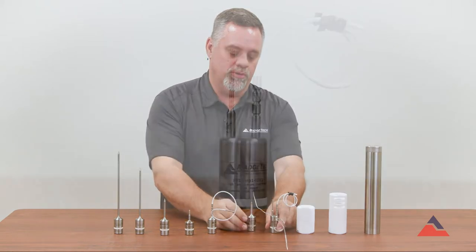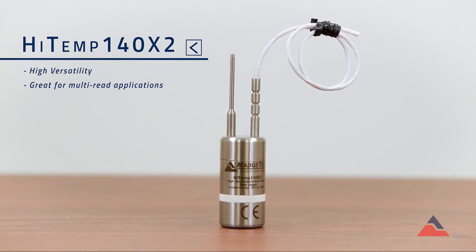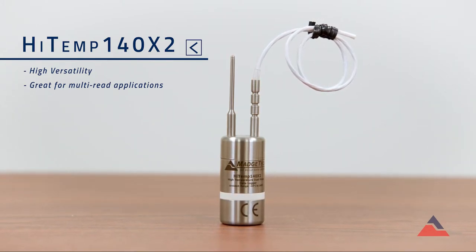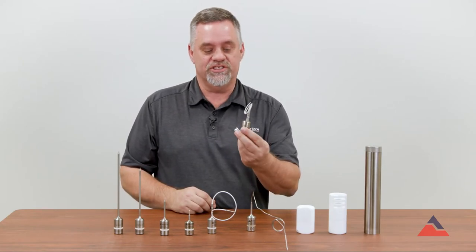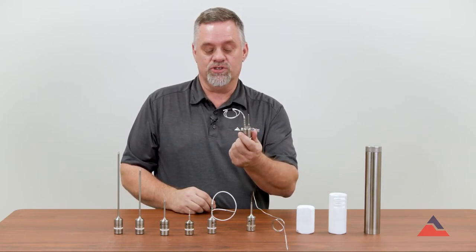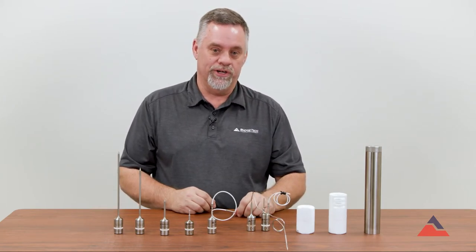Our other style is the X2 probe, and this comes in combinations of both rigid and flexible — rigid with a PT, two flexibles, a PT with a flexible — so there are different probe options for that X2. It's a very versatile logger, 100% submersible, and good up to 140 degrees C.